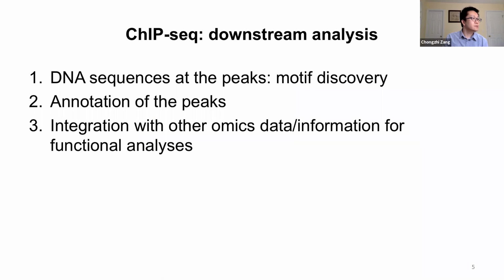For downstream analysis, we'll cover these few topics: DNA sequence at the peaks, namely DNA sequence motif discovery, and annotation of the peaks. If we know the genomic location of all the peaks, what can we do about it? What other information can we learn from the peaks? And also integration with other omics data and functional analysis.